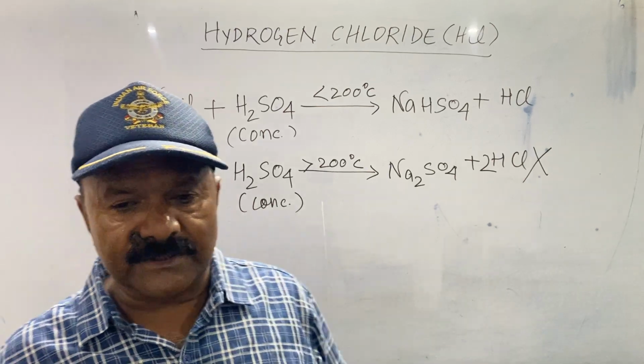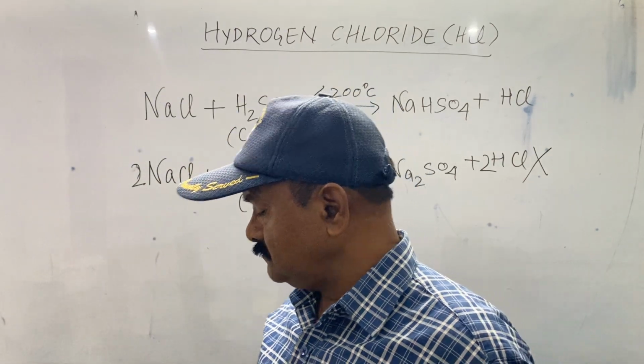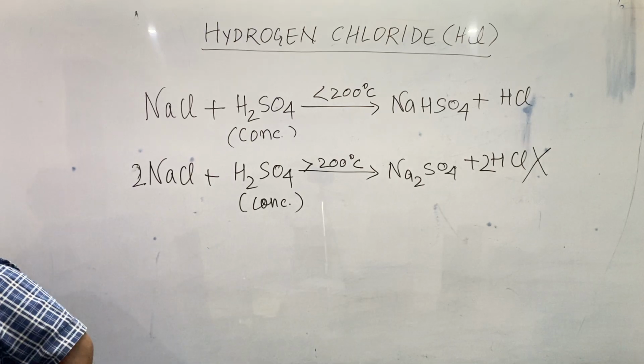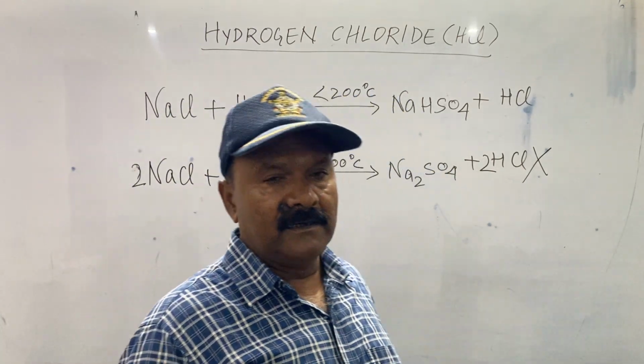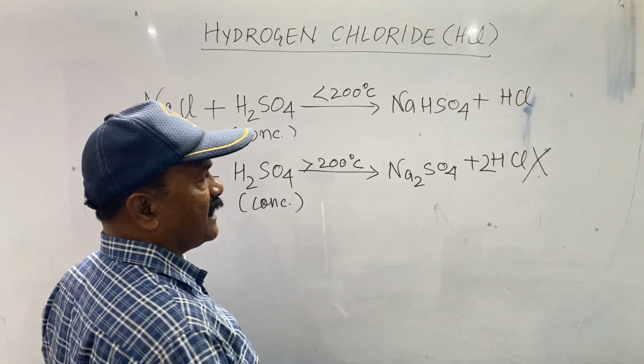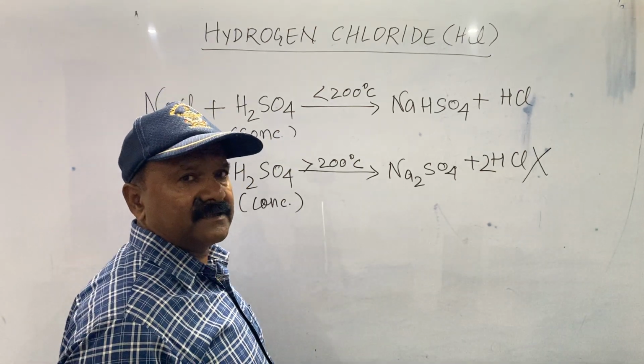Now, I am going to tell you about the lab preparation of hydrogen chloride gas. For the lab preparation of HCl gas, we have to set up the apparatus.